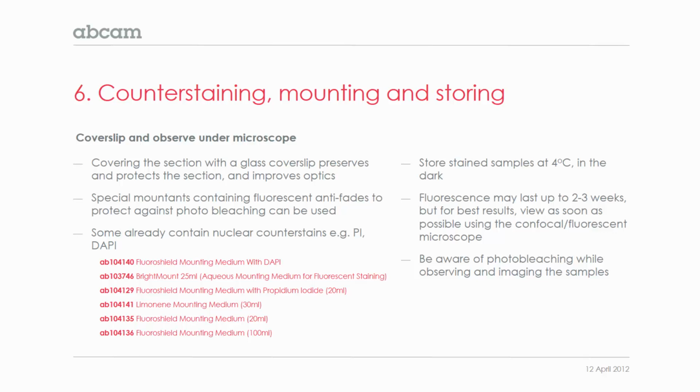Many of these special mountants already contain nuclear counterstains such as PI and DAPI. We have many of these at Abcam. For example, we have FluoroShield and BrightMount. And if you want to try some, I can recommend looking these up on the website.